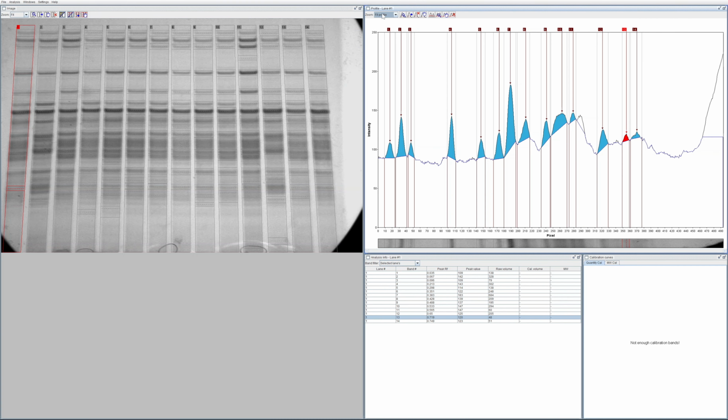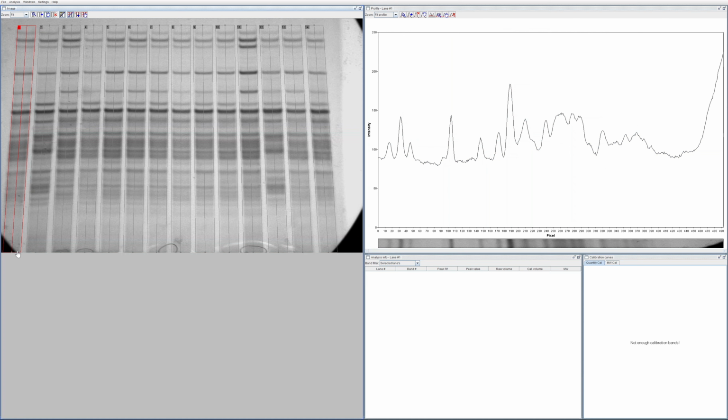Again, these tools are extremely small, modify lanes. I don't know if we can, so I think we can kind of bend lanes, but they seem to be fixed at the bottom, or you can edit them from the bottom or the top, but you can only edit them in straight lines.